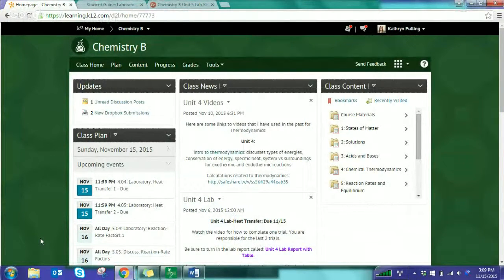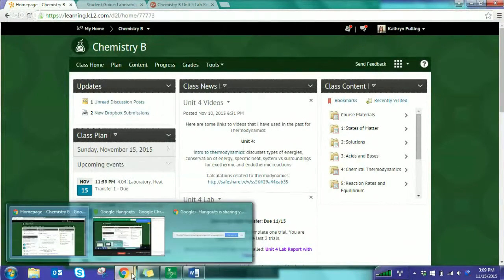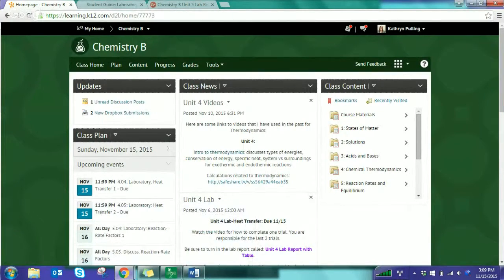Okay, so this recording is for the Unit 5 lab, right? In this lab, we are observing reaction times and seeing what effect concentration of your reactants has on this, right? A couple of things that you'll want to grab from the course website.